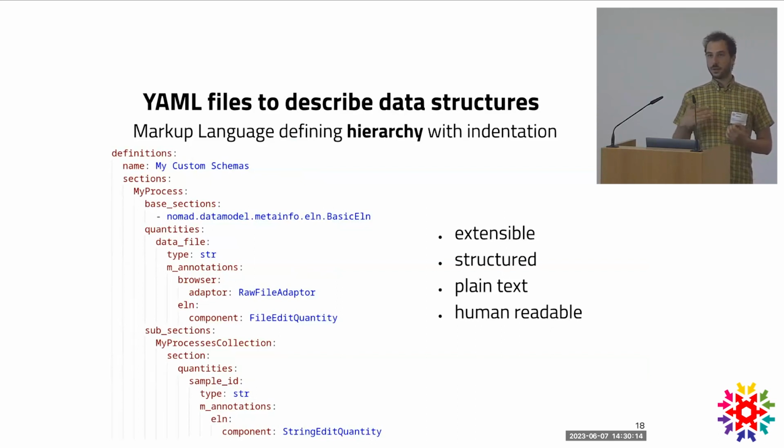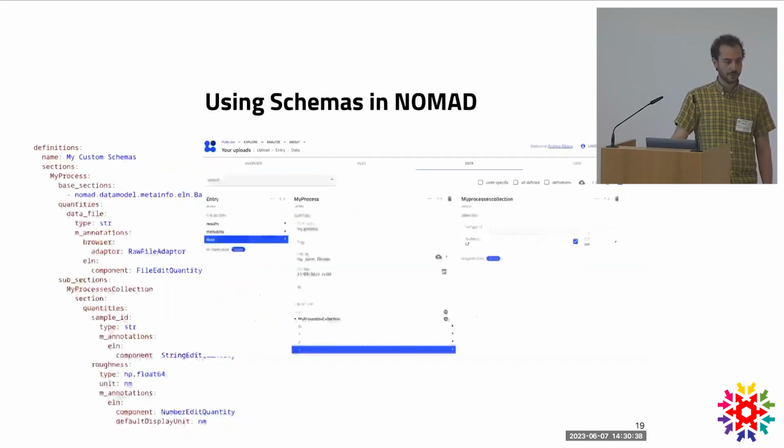Especially, we are also trying to find a flexible way to describe the data. Many use cases foresee changes in the data set that we are collecting, because maybe we are exploring new techniques, or we can't actually standardize. So we need a way to structure the data in a flexible way. YAML accomplishes many of the needs that we have.